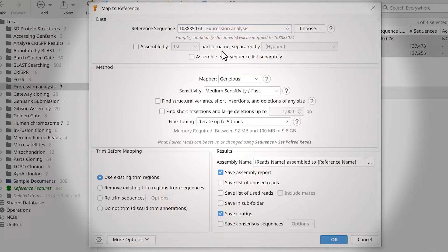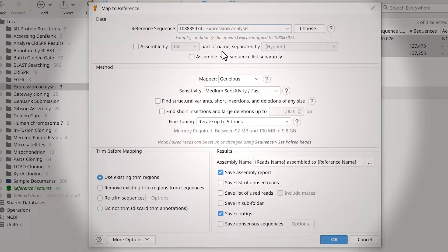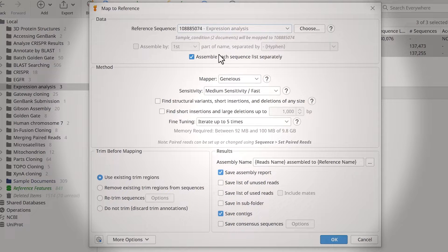If you're assembling more than one set of reads, like in this example, you can assemble each file separately by selecting this option.